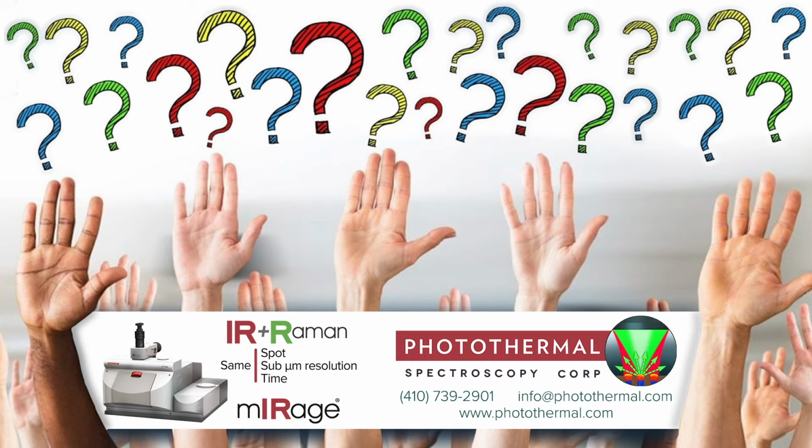So it works. What we then wanted to do was to use a microfluidic system, and Mustafa very kindly lent us one, and we had some preliminary data with it. One of the problems we had was the cells for some reason not attaching properly, and because you have to turn it upside down, you need the cells attached to the top surface.